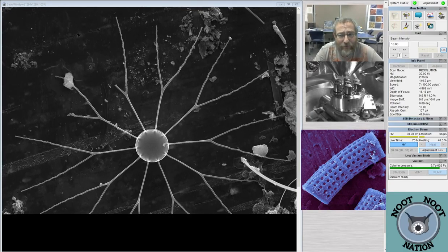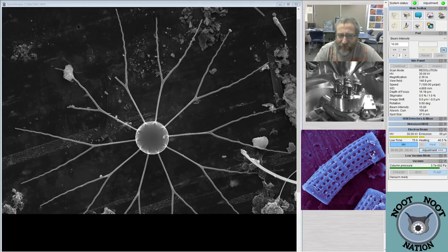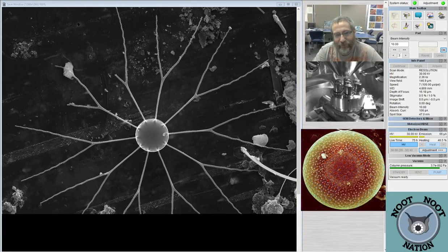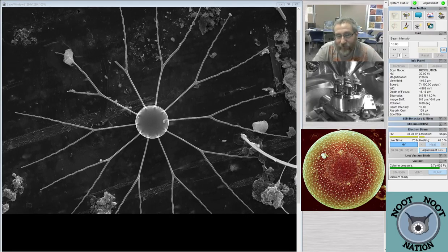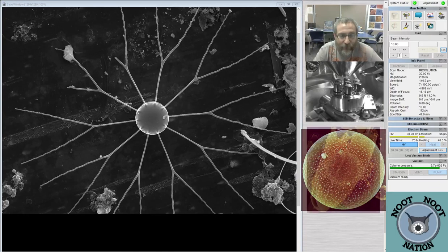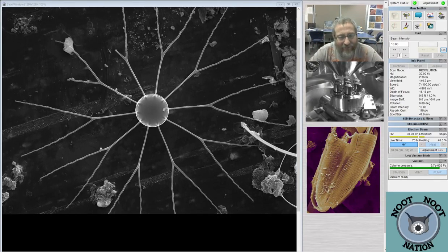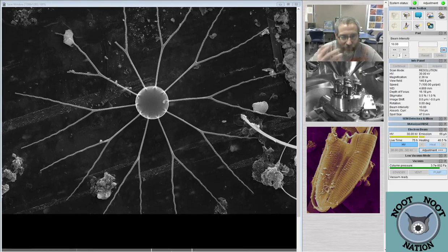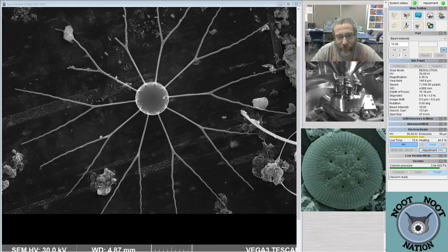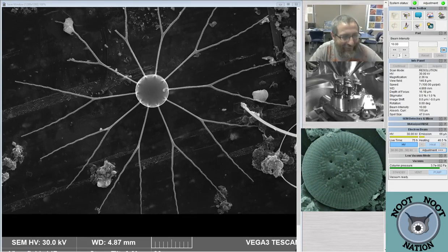Sometimes when it's in the SEM and I'm looking at it, I can't figure out what genus it is, but that's because it looks so different in the SEM than it does in the light microscope. I might see something like Pseudostaurosira, or it just doesn't look the way I'm used to seeing it, and it takes me a while for my brain to recalibrate to what that looks like in the SEM. But more typically, it's just like, I've never seen anything like this in freshwater, and neither has anybody who studies freshwater, because they don't occur there.